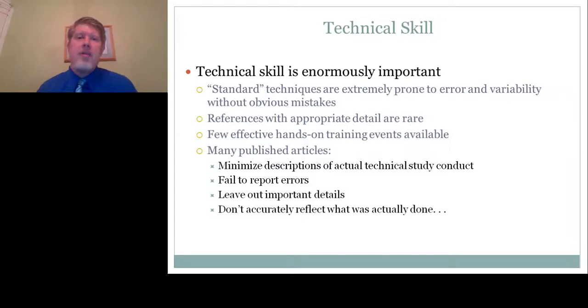And that's an important concept to have. It's one of the things that tends to get missed when looking at the use of these in vivo models. Yes, they're standard techniques. They are relatively well established. They are relatively consistent in the gross details across the industry. But within that, there is the possibility for error and variability that has nothing to do with the species and the animal individuals I talked about earlier, but in how you perform these techniques and whether you're applying them properly.